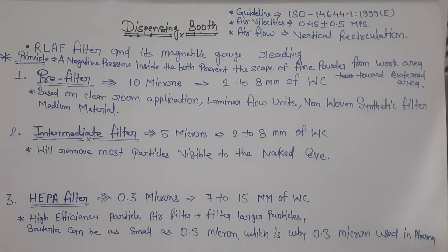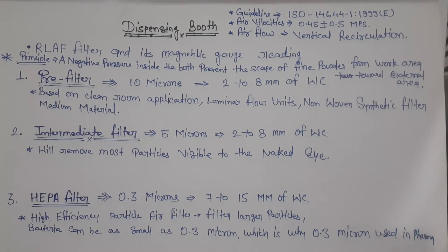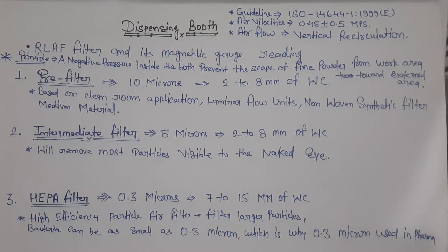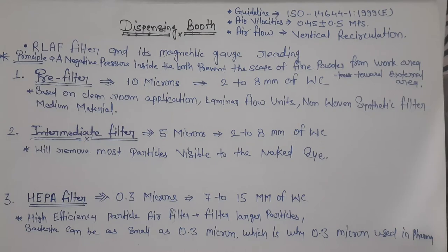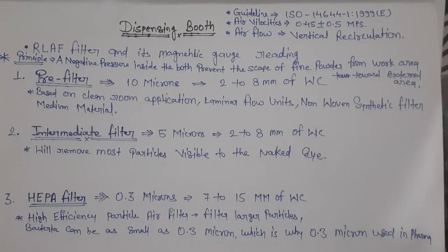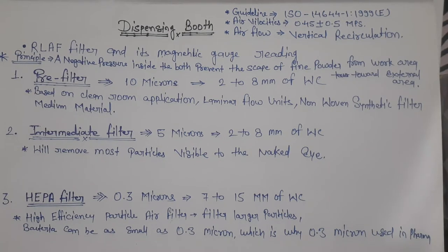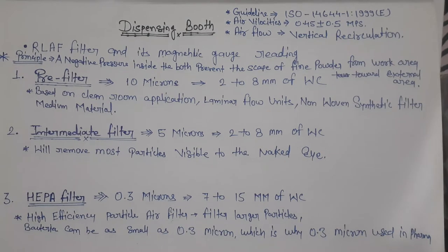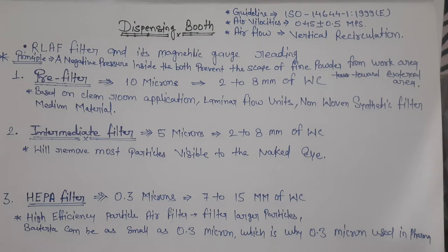The guidelines used for dispensing booths is ISO 14644-1. Air velocity is 0.45 plus minus 0.05 mps and airflow is vertical recirculation. Let's see the return laminar air flow filter and its manometric gauge reading. The principle is based on negative pressure inside the booth to prevent the escape of fine powder from the work area toward the external environmental area.